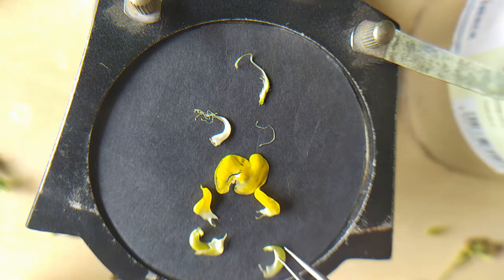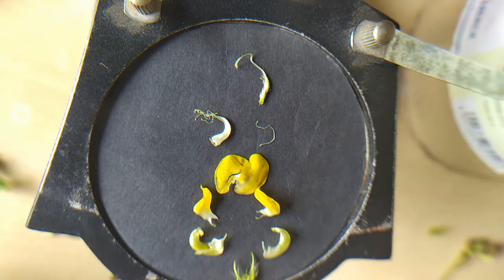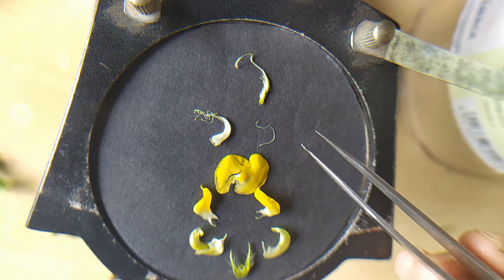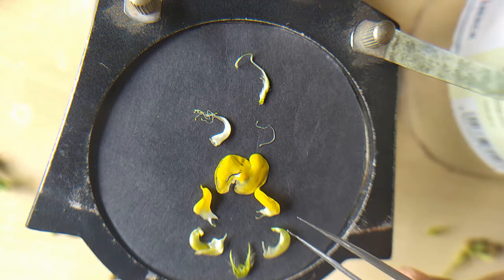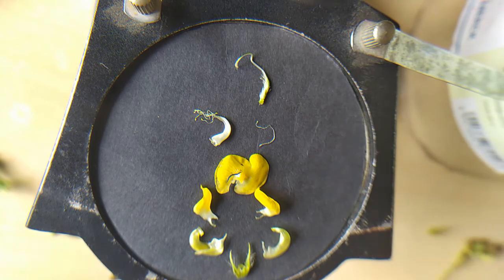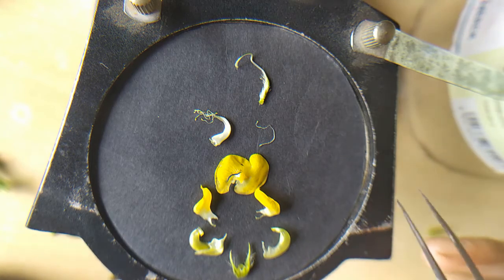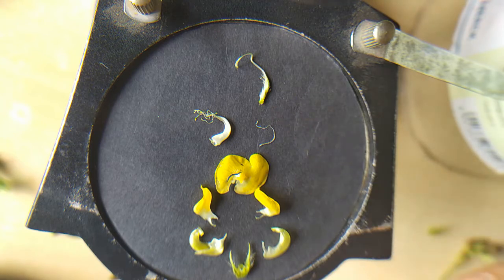The parts of urad bean and green gram are somewhat not plain, so it is hard to paste these parts on the mounting sheet. So this is all about the dissection of urad bean, and the same dissection will be there for green gram. So I am showing you once the green gram dissection here, the 9+1 condition, then the gynoecium, and the same will be followed for your practical.